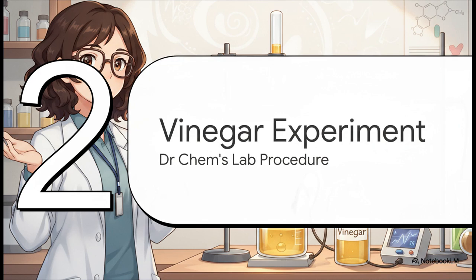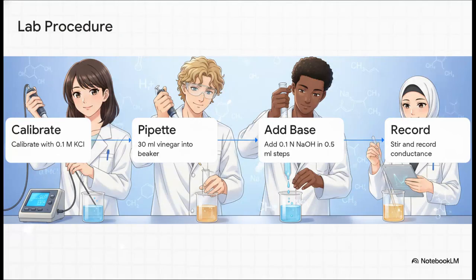Section 2. Dr. Chem's vinegar experiment. All right, let's step directly into Dr. Chem's shoes and run through the precise chronological steps of the lab setup. First up, we must calibrate our conductometer, typically using a standard 0.1 molar potassium chloride or KCl solution. Once calibrated, we carefully pipette 30 milliliters of our diluted vinegar solution into a beaker. Next, we fill a burette with our strong base, which is 0.1 normal sodium hydroxide, or NaOH. We then add this base in small, highly precise 0.5 milliliter increments, and after every single addition, we stir the solution well and record the new conductance value.